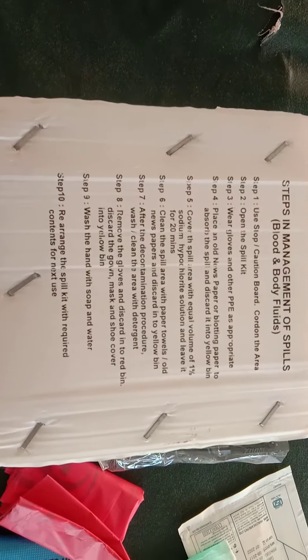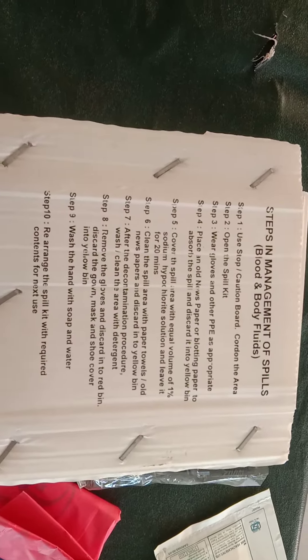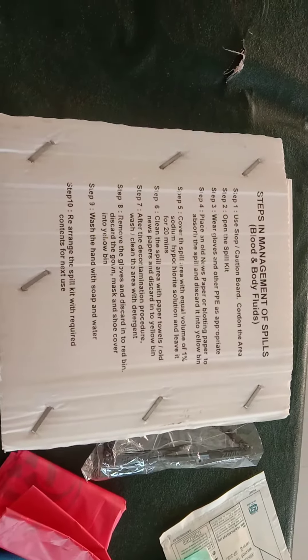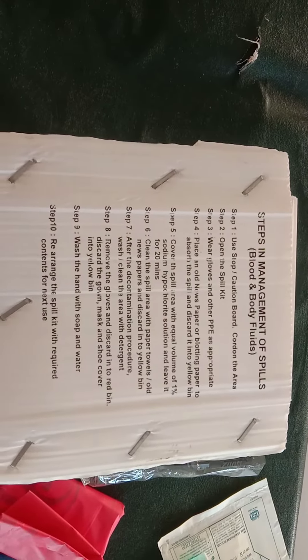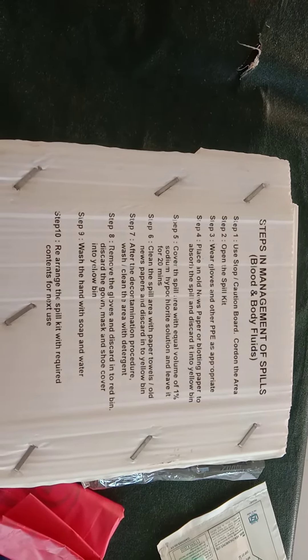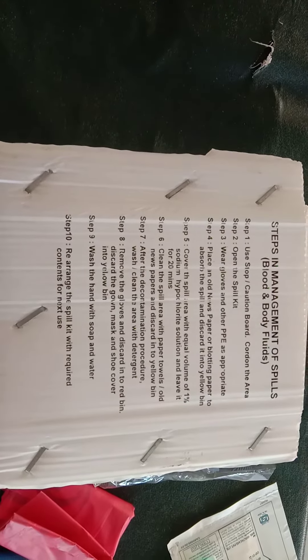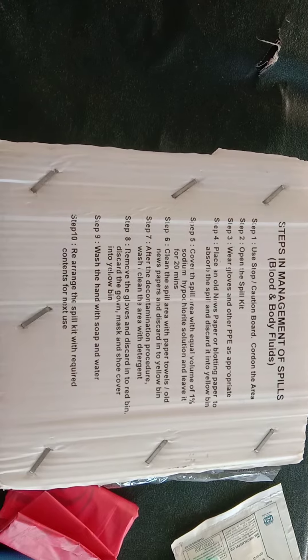Steps in the management of blood and body fluid spills: Step one — place a caution board and cordon the area. Step two — open the spill kit, wear gloves and other PPE as appropriate, then place old newspaper or blotting paper to absorb the spill and discard it in the yellow bin.